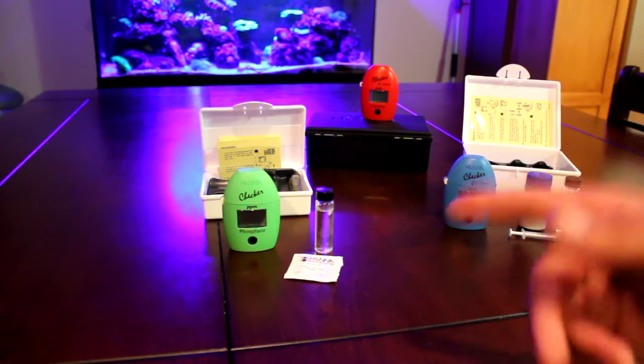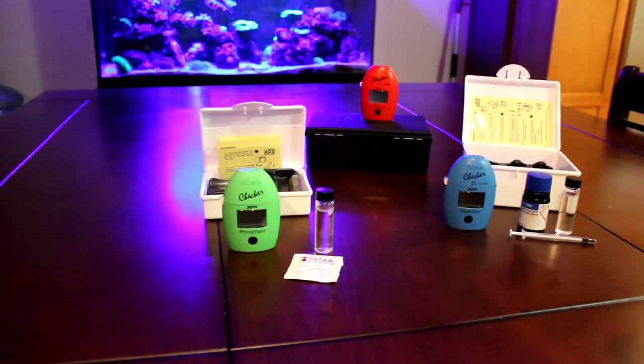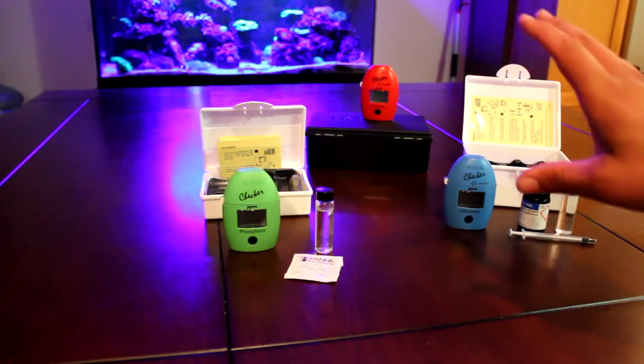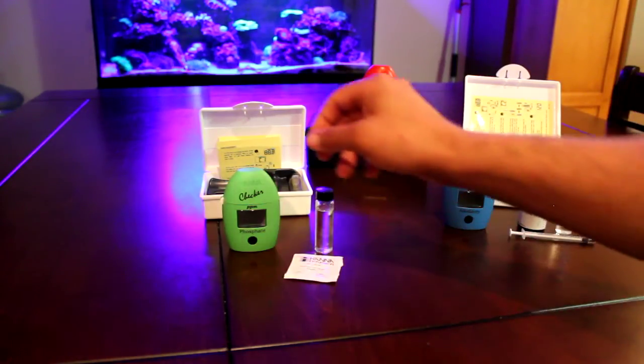Here we're going to do the Hannah Checker phosphate and alkalinity test. They're both really simple so I can get them done in one video. Calcium back there is a bit of a pain so it'll have its own video.